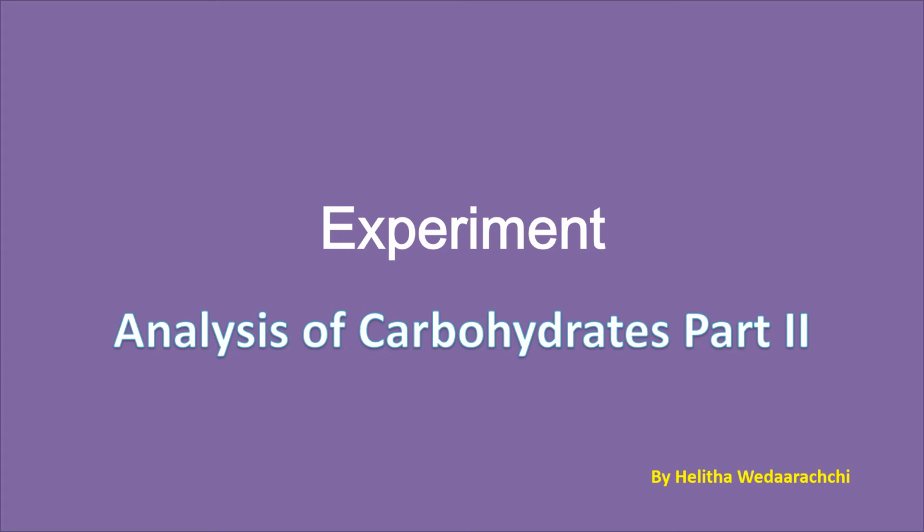Experiment 2, Analysis of Carbohydrates Part 2. Osazone Test.